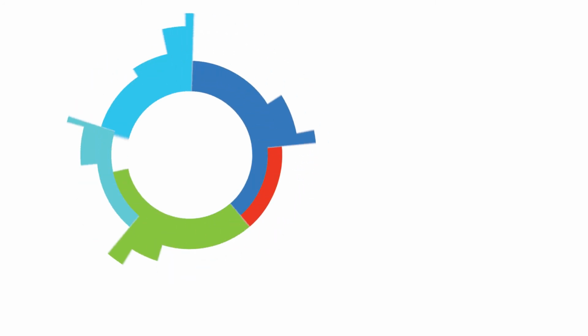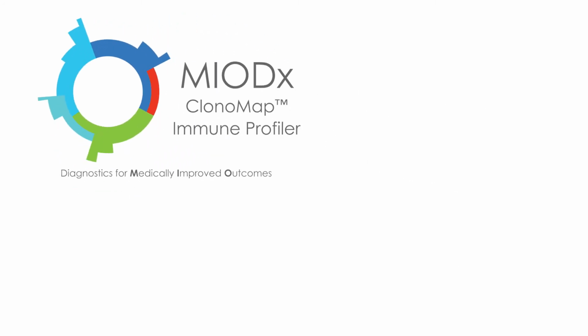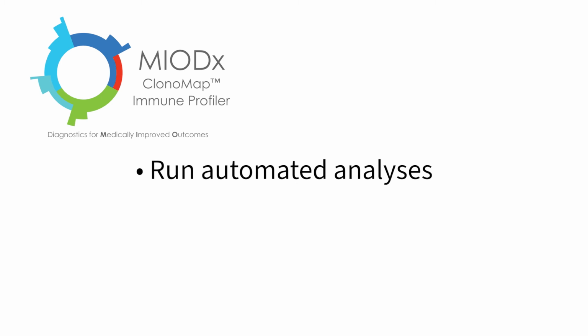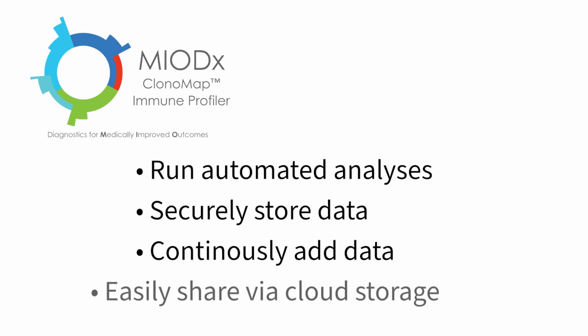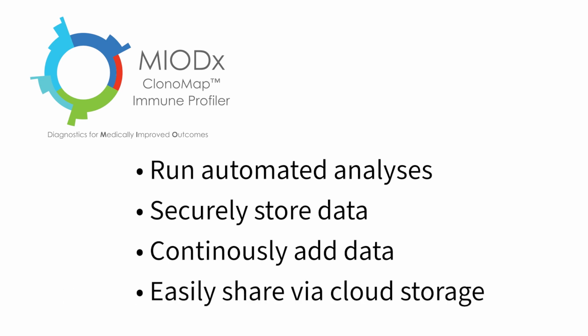In summary, with the ClonoMap Immune Profiler, the user can run automated analyses, securely store the data for later access and use, add more data to run additional analyses and draw conclusions about their studies, and share the data with other users in their projects.